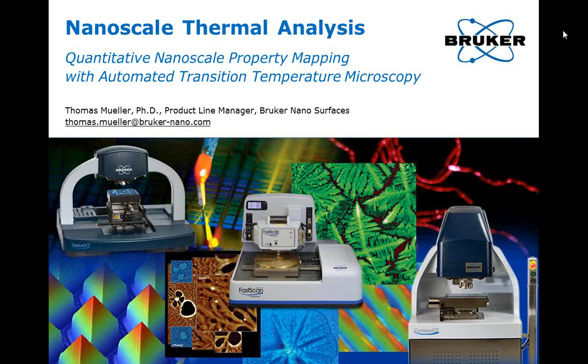Thank you very much, Steve, and thank you, everybody. Good morning, good afternoon. Thanks for joining us for this webinar about nanoscale thermal analysis. As Steve said already, I'll focus today in particular on the new capability that we're introducing now, automated transition temperature microscopy.